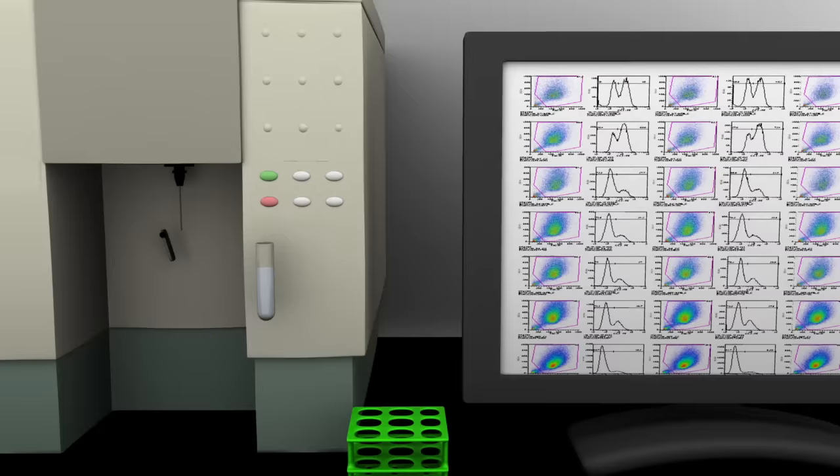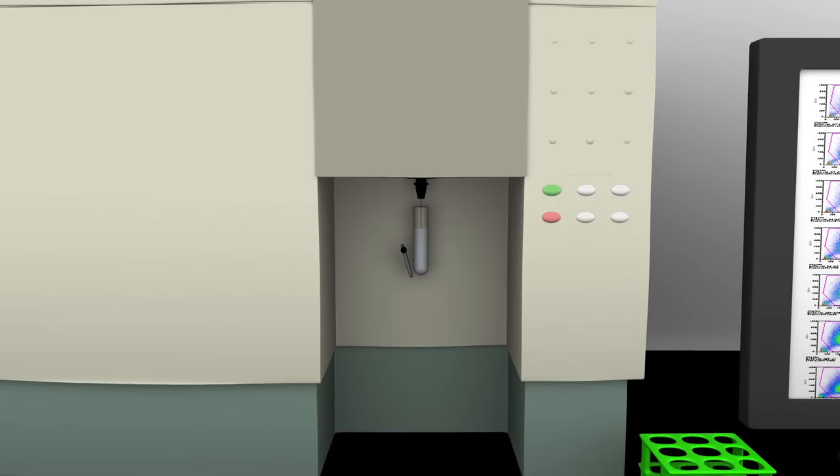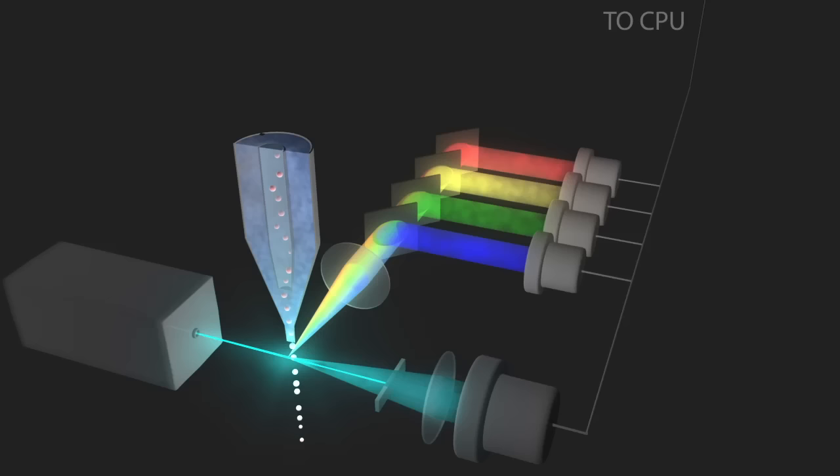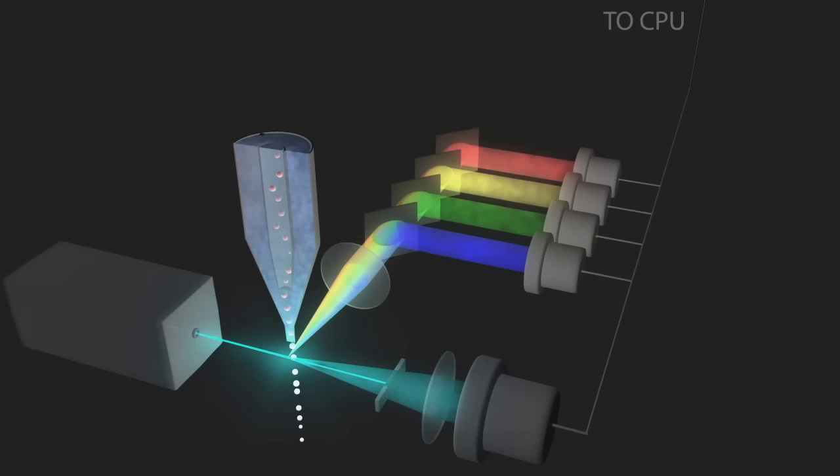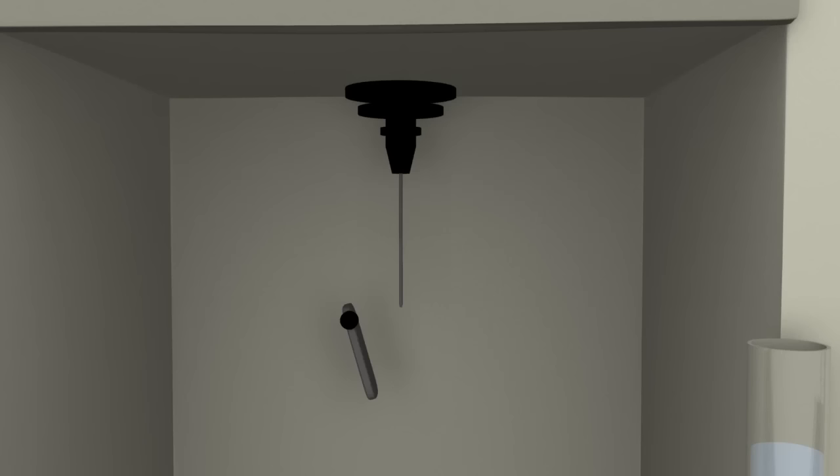How does a flow cytometer analyze the size, shape, and properties of individual cells? A flow cytometer contains several key components, including the sample, fluidics that move the sample into the flow cytometer, lasers, optics which gather the light, detectors to sense the light, and a computer system to output the data into a form that can be analyzed by the researcher.